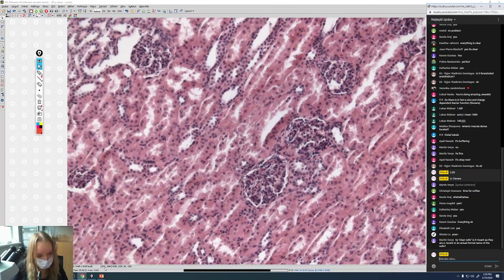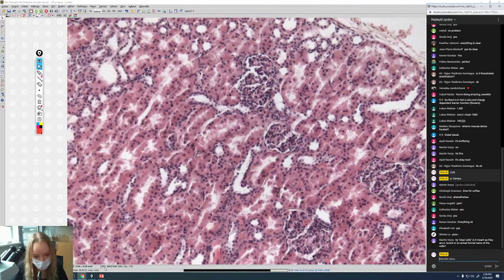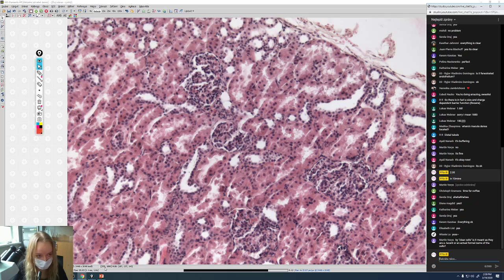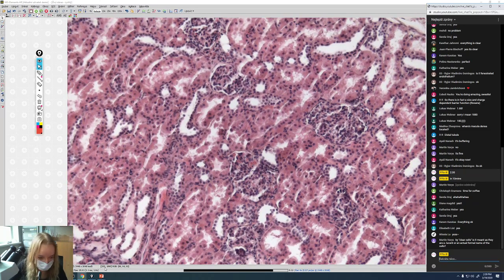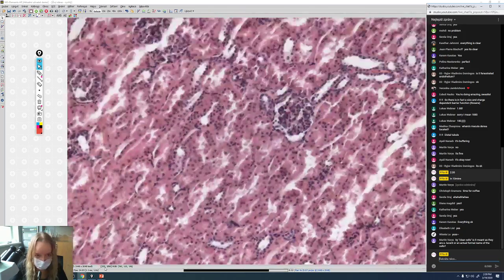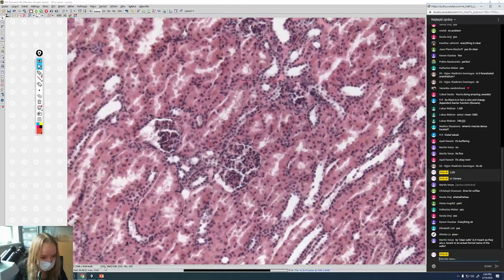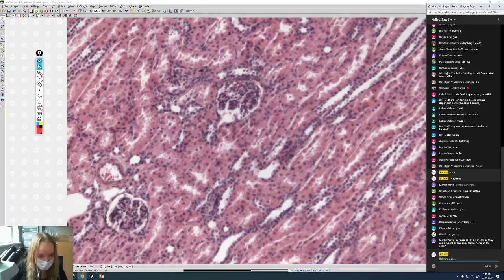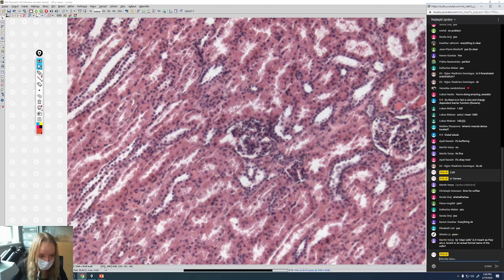It's not that good. We're sorry, you just have to wait for us to find a good one. We're not very satisfied with what we're seeing right here. Yeah, maybe this. Maybe. Yeah.